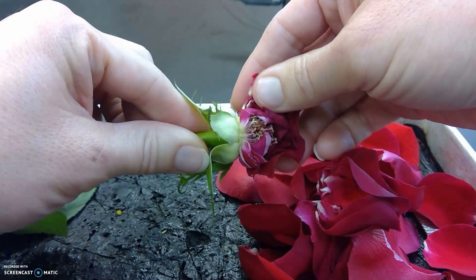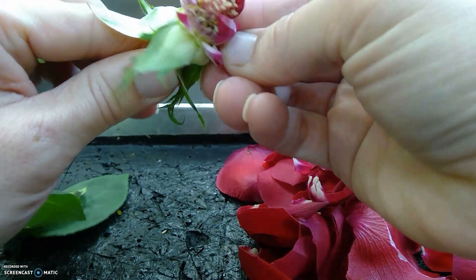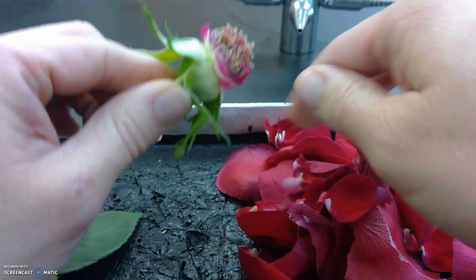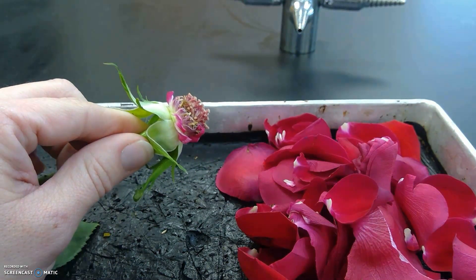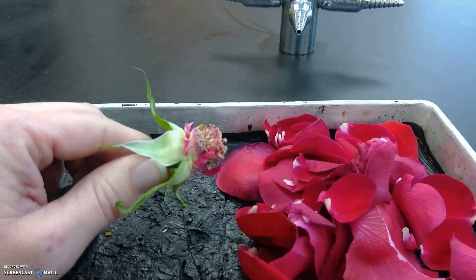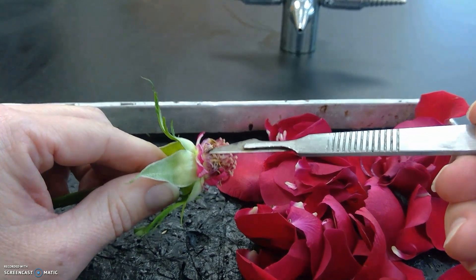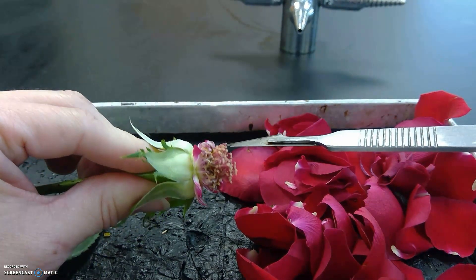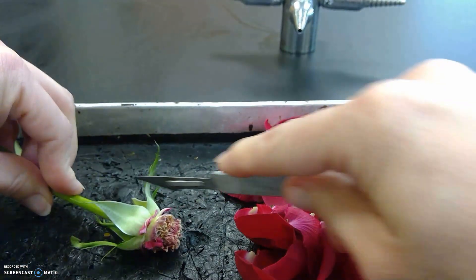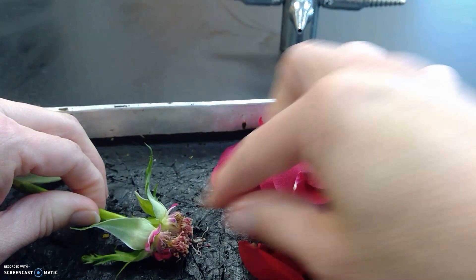Pollinators would obviously be things like bees and birds. This one you can see has many anthers and has multiple places for this flower to be fertilized. We have these outside anthers and inside stigma and styles. I can go ahead and cut this open down the middle for us to see the ovary.